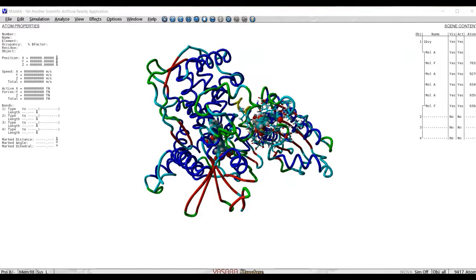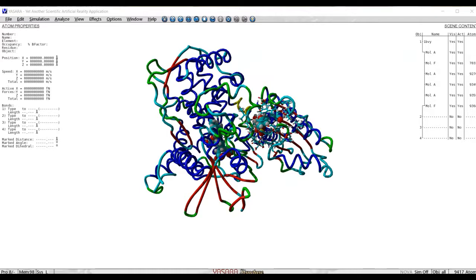In umbrella sampling, one takes a structure including a ligand and, for example, a protein, and one attempts to move the ligand away from the protein in small increments.